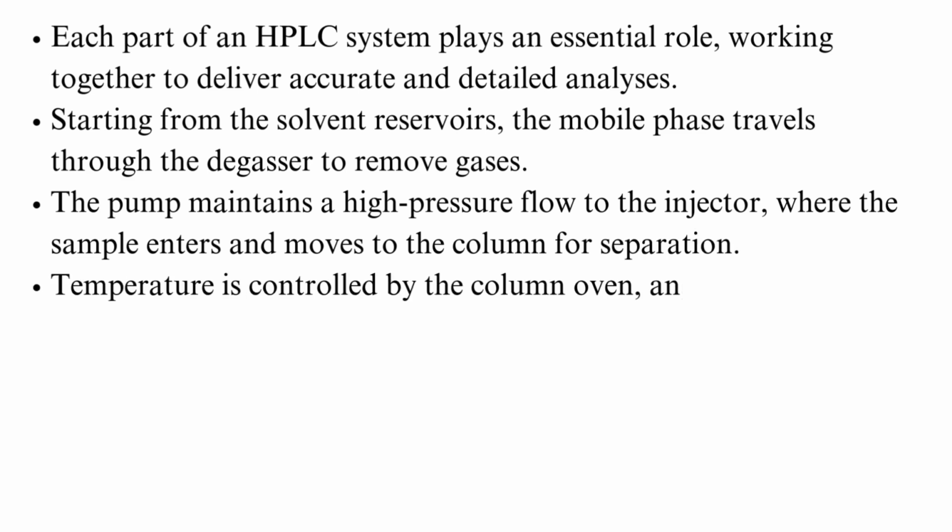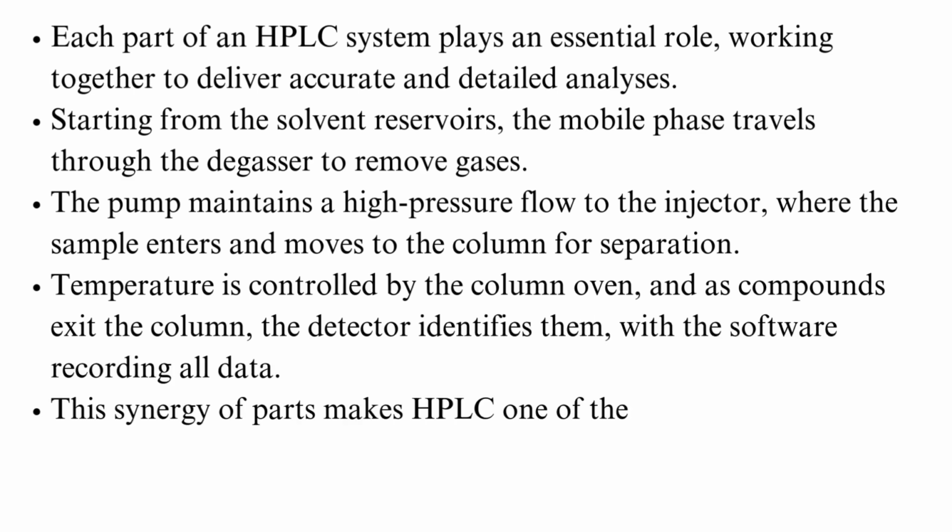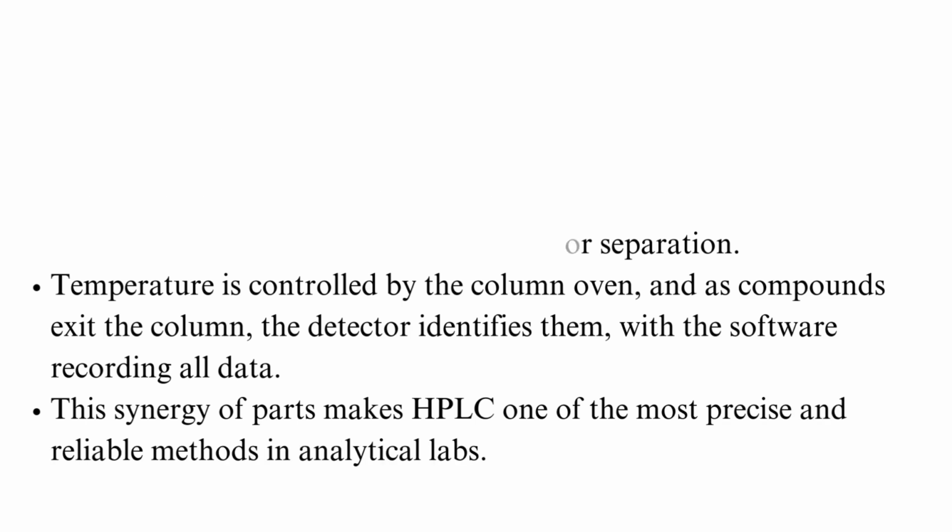Temperature is controlled by the column oven, and as compounds exit the column, the detector identifies them, with the software recording all data. This synergy of parts makes HPLC one of the most precise and reliable methods in analytical labs.